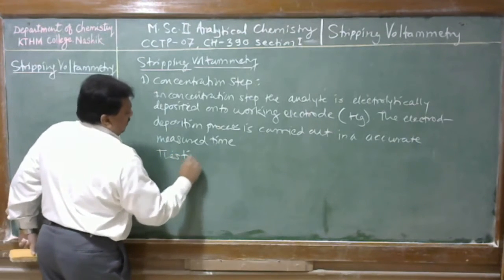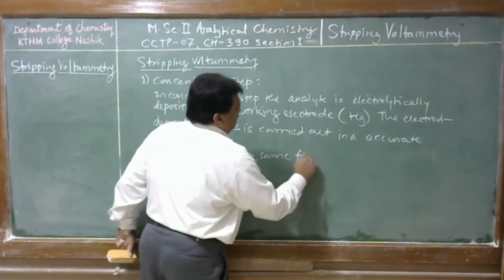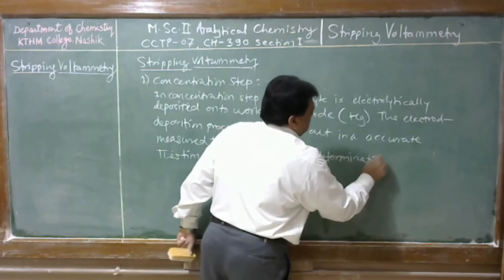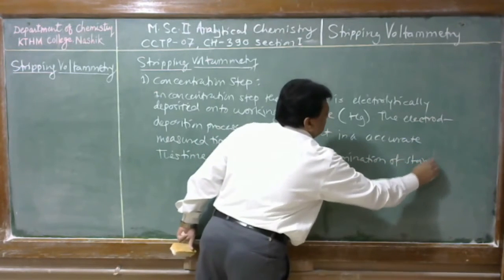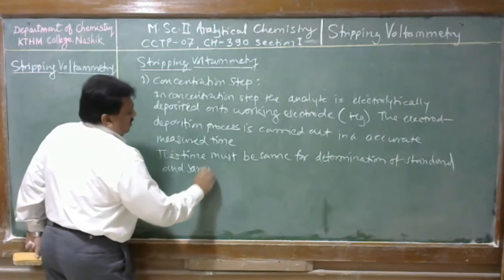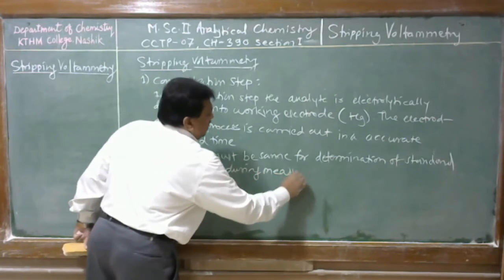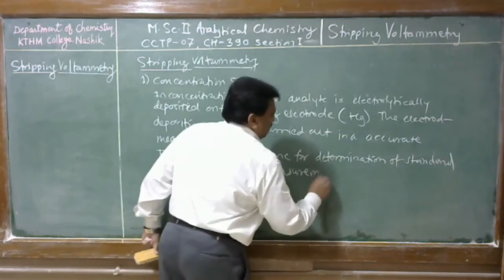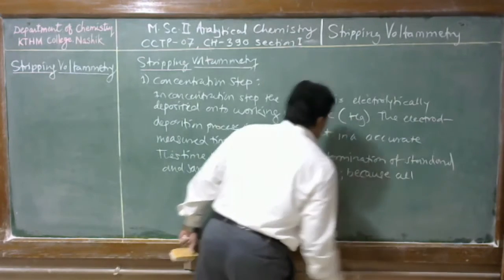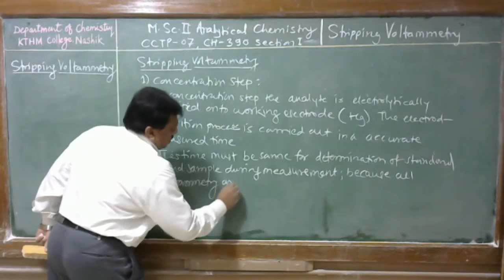This time must be the same for determination of standard and sample during measurement, as it is a comparative technique, because all voltammetric methods are comparative methods of analysis.